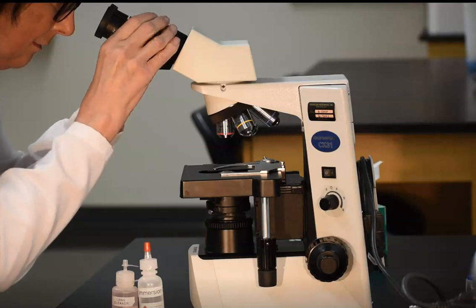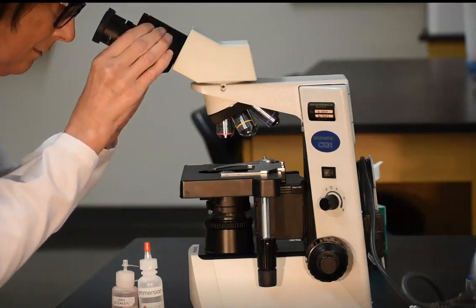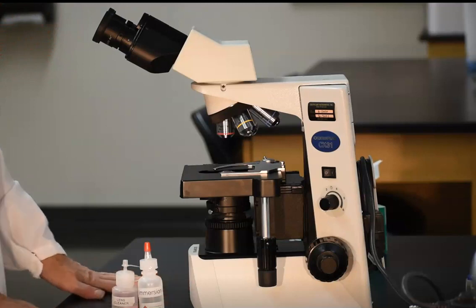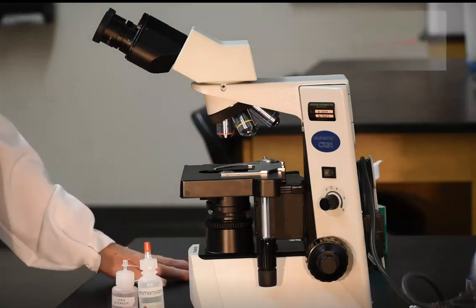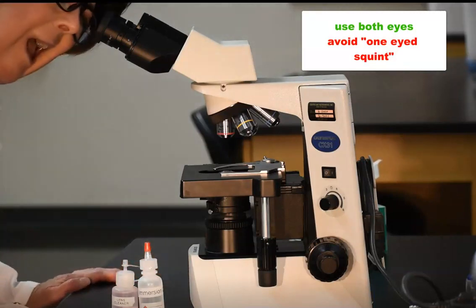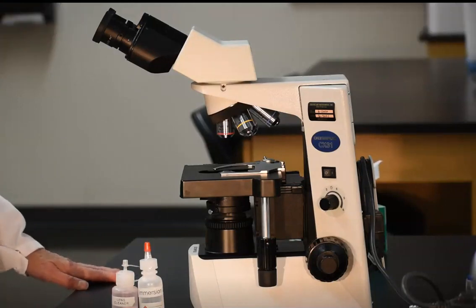The circles of light will be apart in your field of view as you begin. Gently press the oculars together while looking through the lenses until the circles of light merge together. This is the appropriate distance for your pupils. It may take a while to get this right, so be patient. Eventually, it'll become natural to use the scope this way. It'll prevent you from getting headaches. If you can comfortably use both oculars, this is the way to do it. Avoid the one-eyed squint that folks not comfortable with the binocular scope often resort to using.